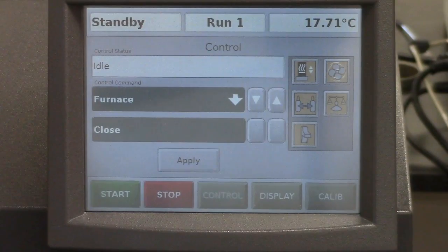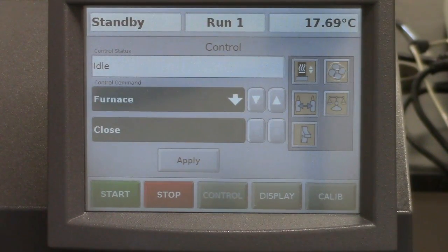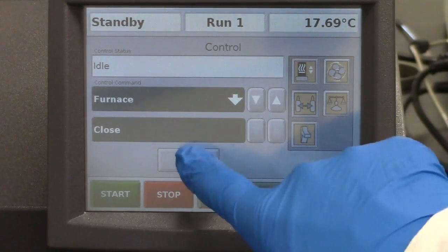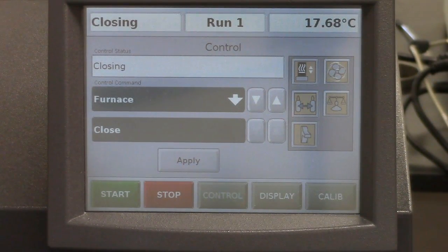Now that our sample is loaded into the TGA, we can close the furnace by pushing apply. The furnace will close.